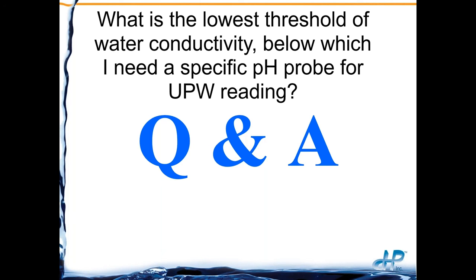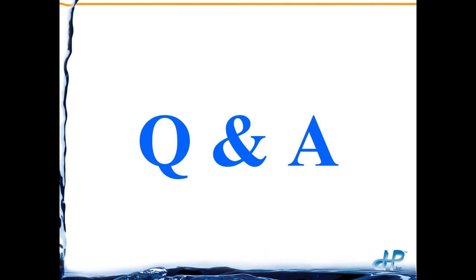Most of the time, some of the pressurized reference systems go down to 10 microsiemens. Some of them can go to ultra pure water, so just read the specifications for them. But rule of thumb, 50 microsiemens, anything below that, if you don't have a pressure or flowing, you're going to get errors in your reading. Or not only errors, but you'll get very short life because the process will suck out all the KCl out of that junction and shorten it, and you can't refill it.